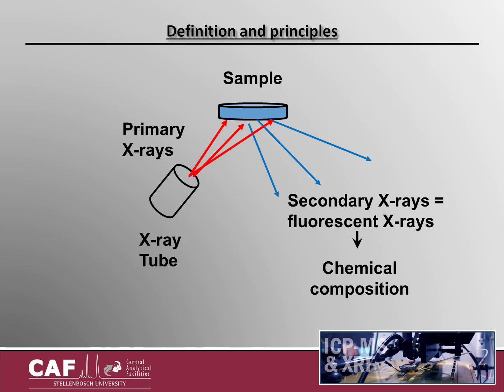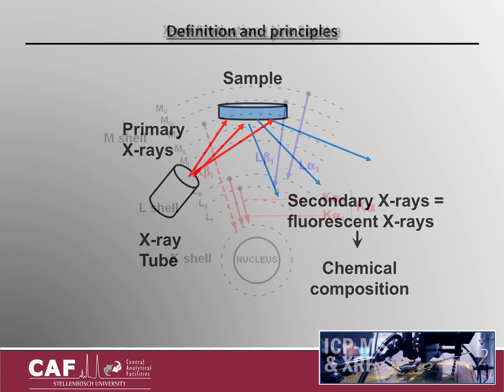X-rays can also interact with atoms in the samples by absorption and scattering in either an elastic or inelastic manner. These interactions will need to be addressed and compensated for.